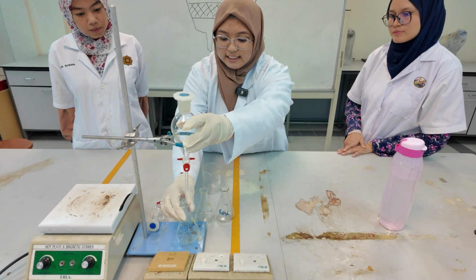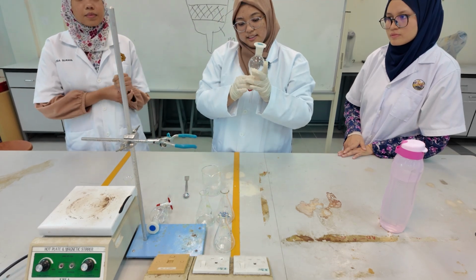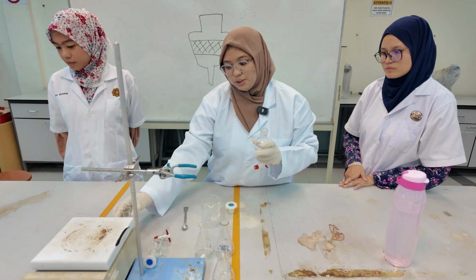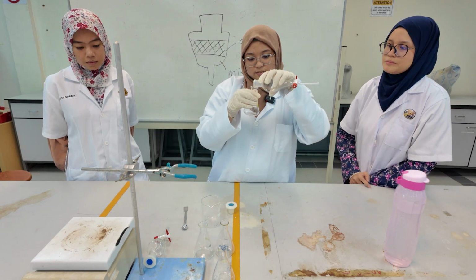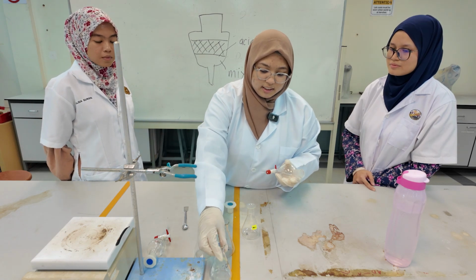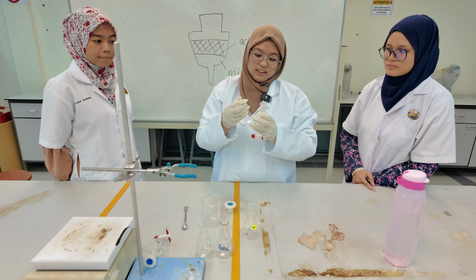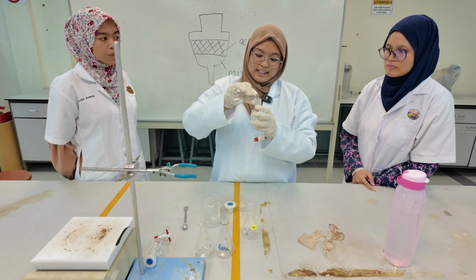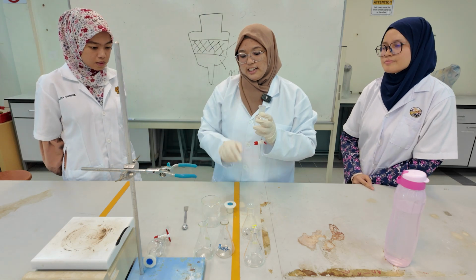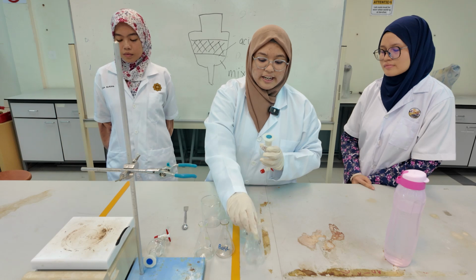Once all the acid has been collected, the remaining liquid will be put back into the mixture flask. To get optimal results, we need to pour the acid mixture back inside and then add some more sodium hydroxide. Just repeat the steps until you're satisfied so that you can get pure acid.